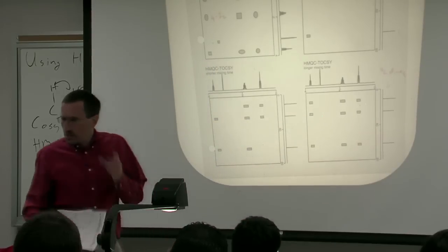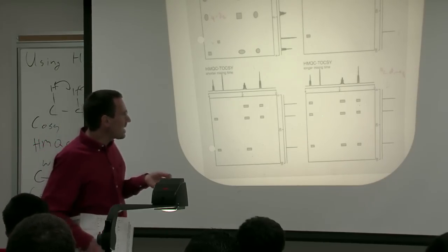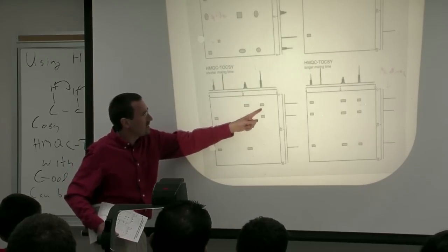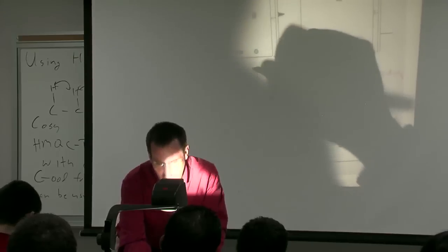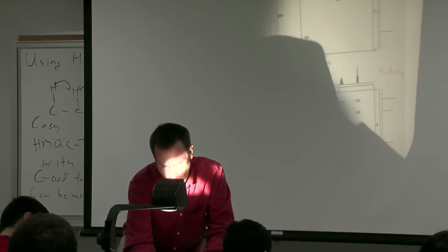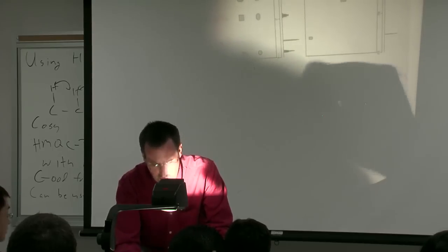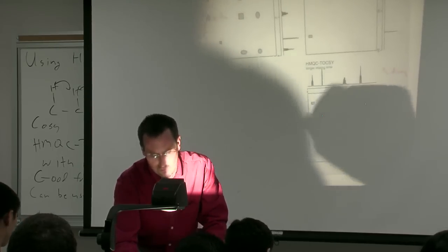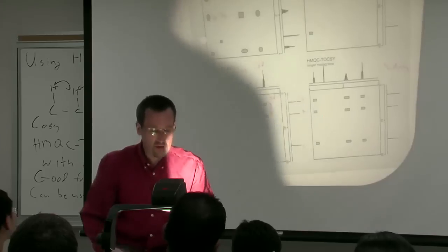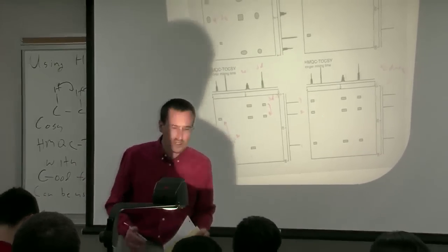Now, what's nice is you can vary the mixing time in this experiment and do the experiment with a series of mixing times, so that you're getting the dispersion of this dimension and using it kind of like a super COSY. In other words, if we have a short mixing time, say I call this 3D, this 2C and this 1A, and I call this 1, 2 and 3, we can go from here to here. In other words, we can go from 3D to 2, and we can go here from 1A to 2 and get sort of a COSY-like behavior in this F1 dimension. Of course, you can do the same thing in the other dimension just as well.